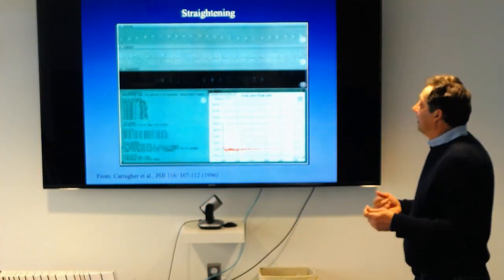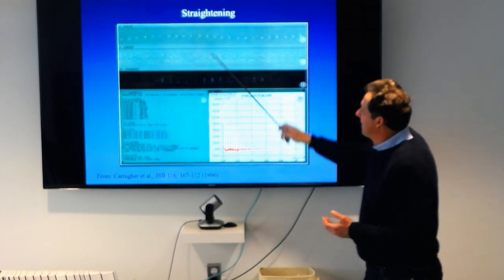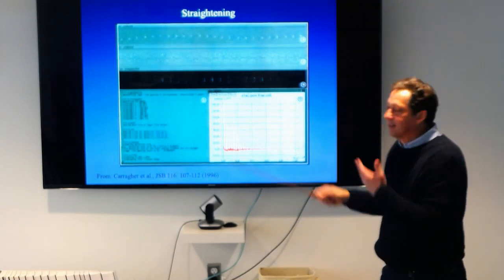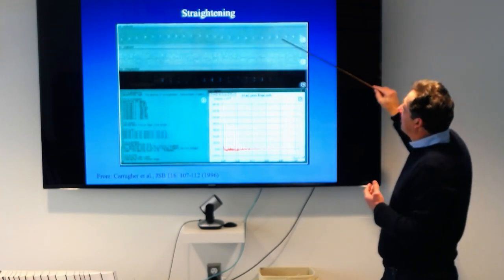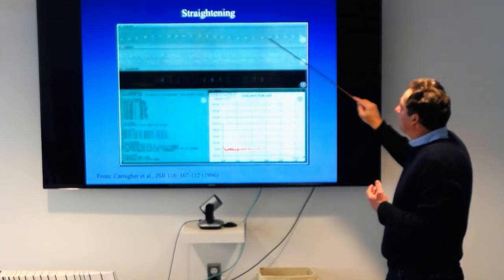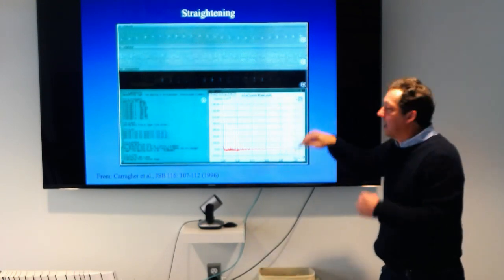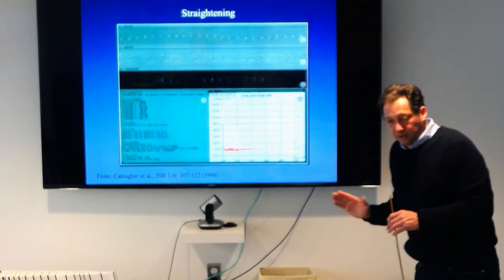There were some filaments that were very flexible, so in order to obtain a good diffraction pattern, there was some image processing to do first to make the filament straight. What they did was you mark the position of the axis, convert this to the best spline curve, and then reinterpolate this line to a straight line, and then you obtain a straight filament. Nobody does that.